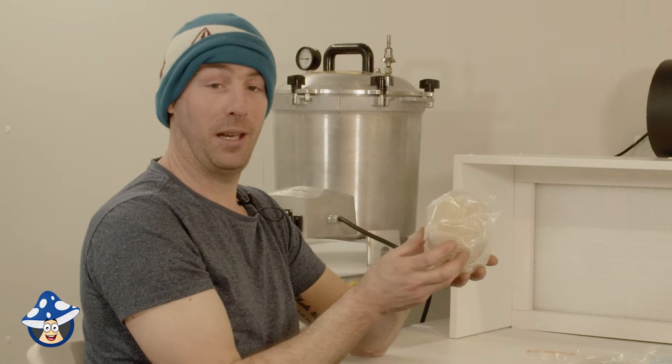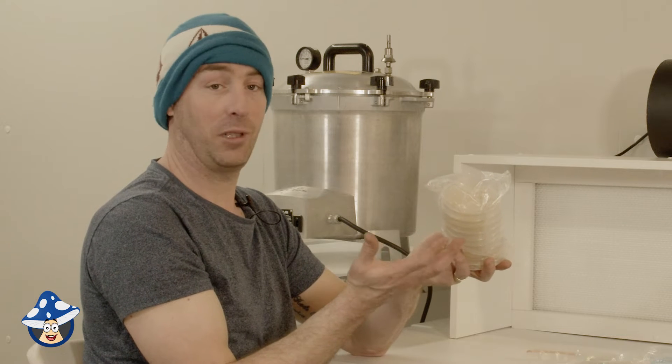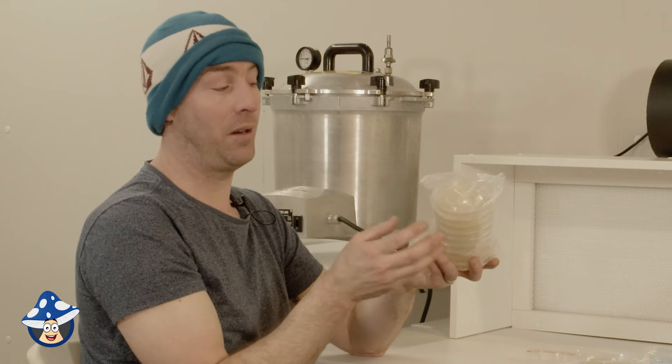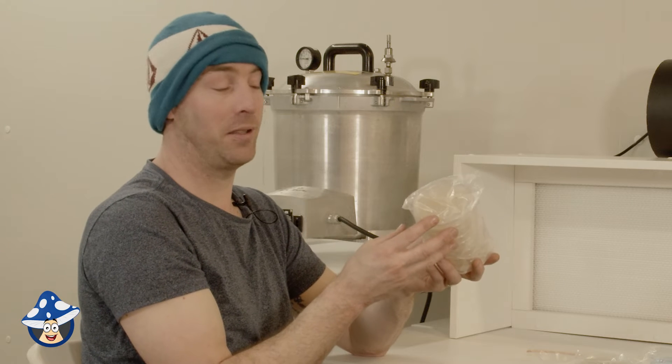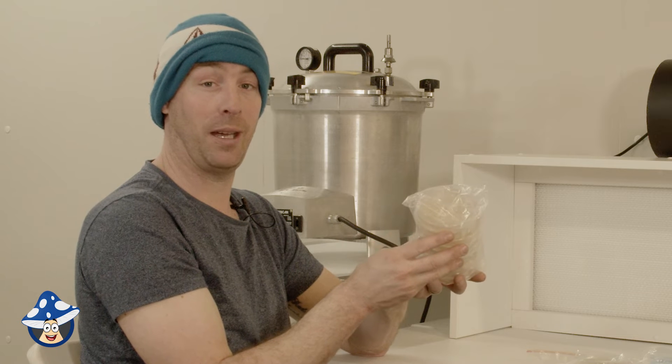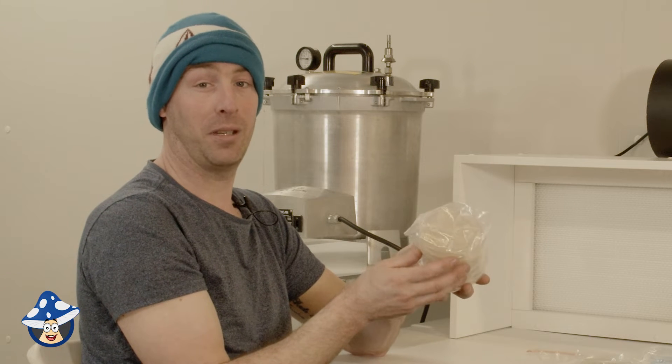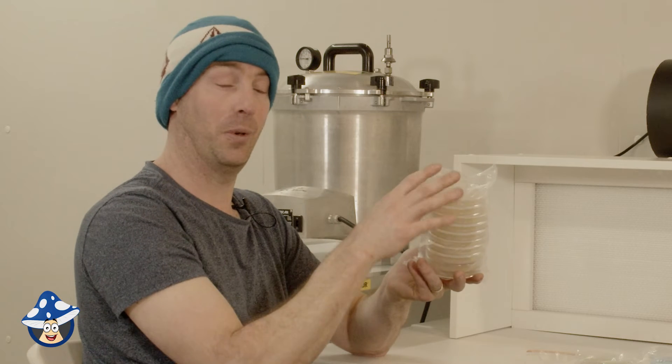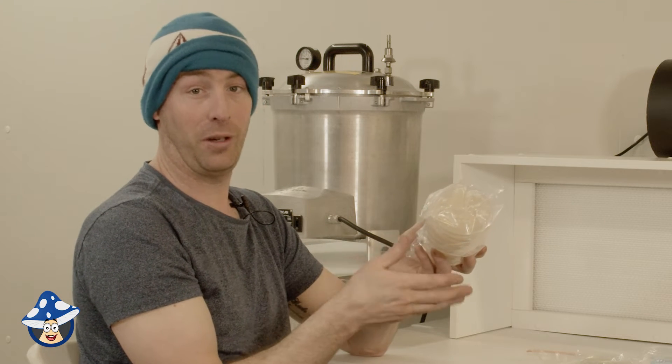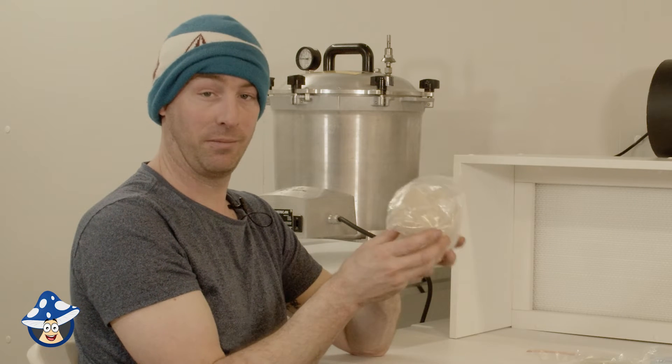MEA agar is just a standard looking agar. This is essentially for everything. So you can do spores, cloning. You need to be very clean with your cloning. Otherwise, everything will grow. Everything grows at full speed. So if you have any problems, they generally out-compete your mushrooms. So you need to be very clean using MEA. Having a flow hood is a must or still air-box the minimum, but you will have some issues if any spores land on your work. So MEA is good for general purpose. Cloning, spores, everything transfers from other agar. Everything grows.